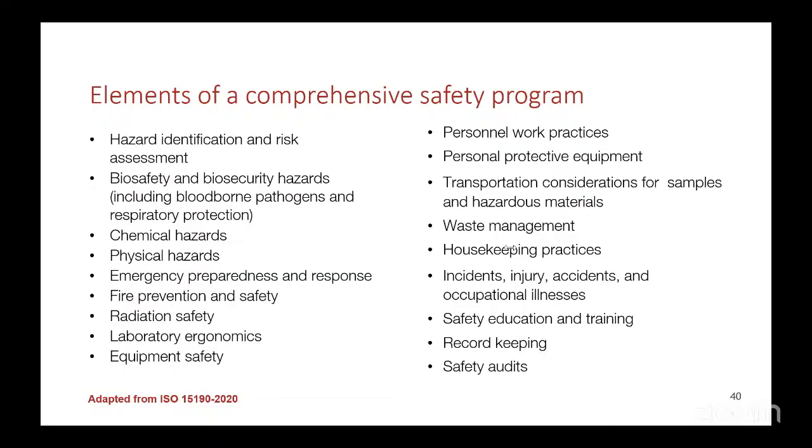So let's say, for example, I'm going to send you a checklist on safety. You look at them: is this in place? You tick yes, no, or not available. At the end of the day, they bring out the non-conformities and the gaps, and from that safety audit they will use those gaps and non-conformities to do a corrective action. As part of the corrective action, they will do a root cause analysis, put in a corrective action, and check to see if it's effective. All this is related only to the safety aspect. That's why I call it safety audit.